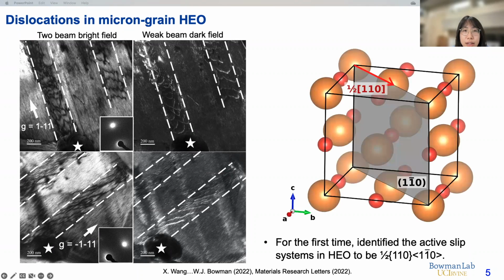As I said, this is very comparable with the dislocation types usually observed in magnesium oxide, in that the dislocation glide is on the relatively less dense {110} planes instead of the {111} planes, which have the highest atomic density. This is very related to the positive and negative charges, in order to remain charge neutral after the dislocation lines pass through the crystals.